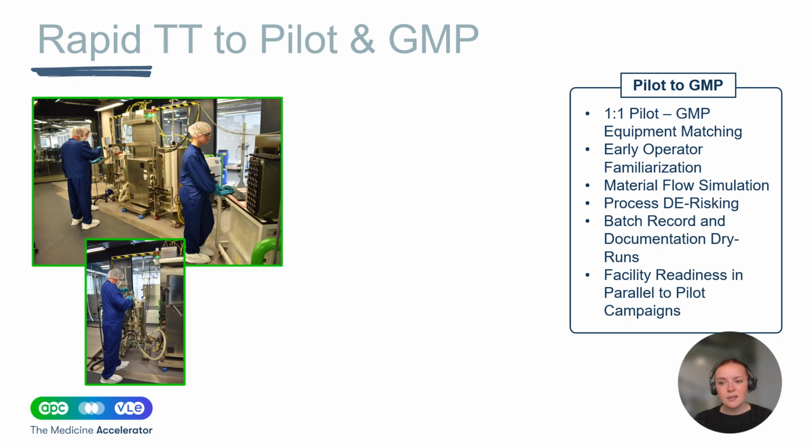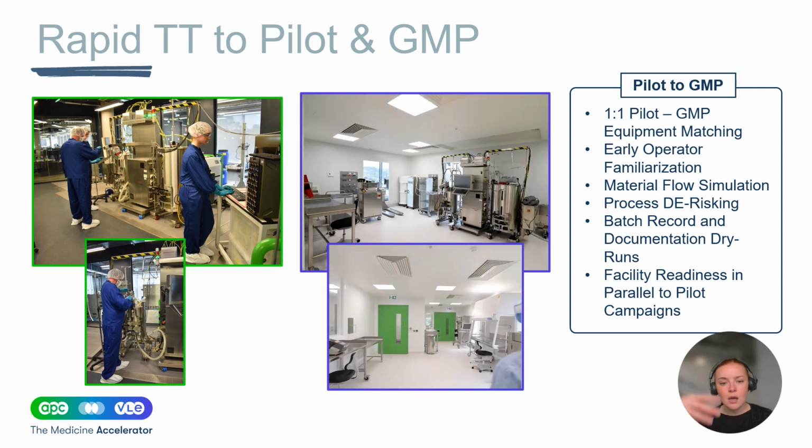And the biggest speed-up in all of this was that while we were still developing and running this process in our PD labs, we were actually getting the VLE suite ready. Because we knew what the process was going to be, and what we were scaling up, and because we already had the equipment in the MSAT lab, we were able to get the facility ready for VLE during those pilot campaigns because we knew there would be minimal changes.